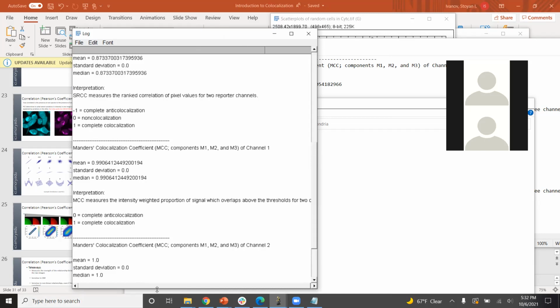It would depend on the claim you're trying to make and how you're going about describing it. I would include all of the coefficients you've been calculating. I'd include those in a table, probably along with the scatter plot.